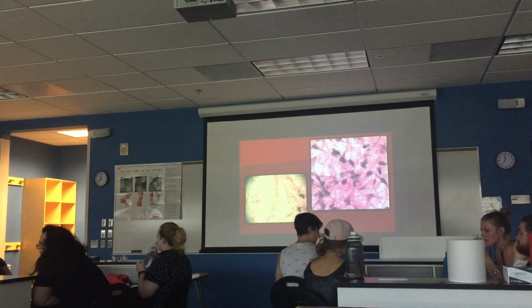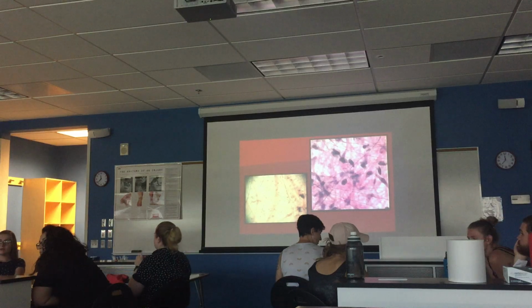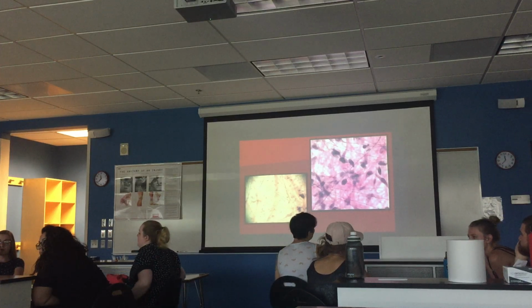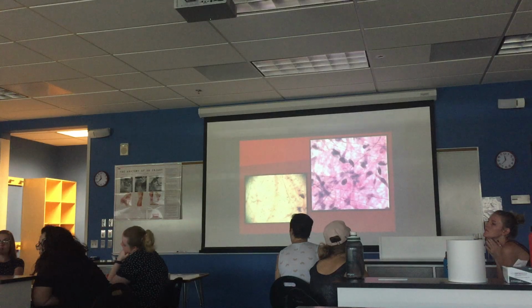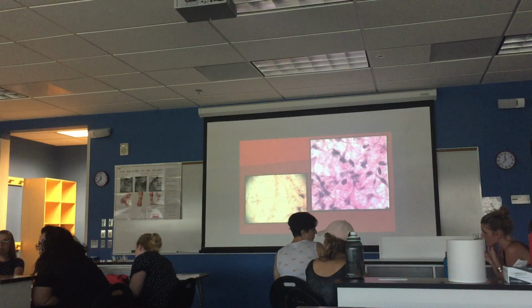So you get an exudate or a secretion of fluid right here like that. That's a blister. So the skin is on top of it, the dermis is below it, and that's your blister. So it's not as much areolar connective tissue as it's an immune system response to either heat or friction or whatever. Oh, okay. It's separating the epidermis from the dermis. Yeah. Yes.